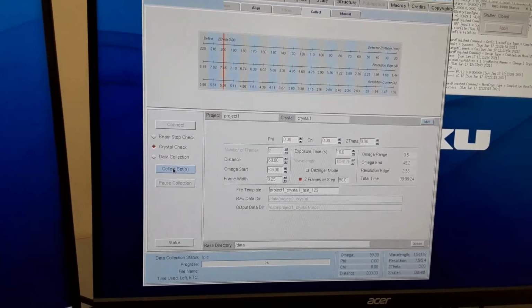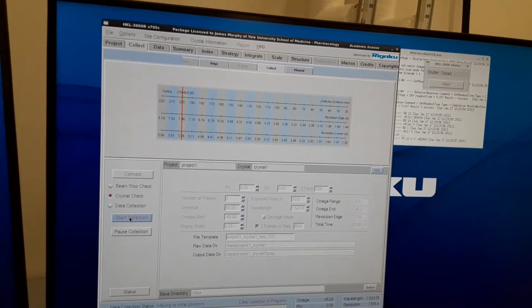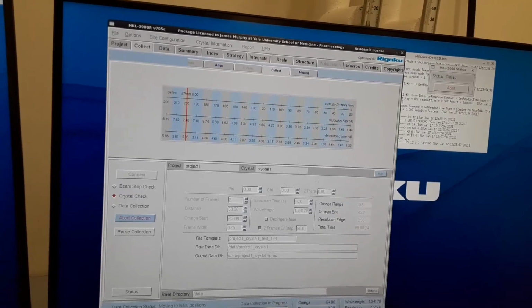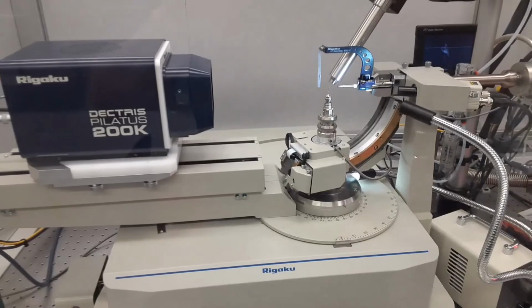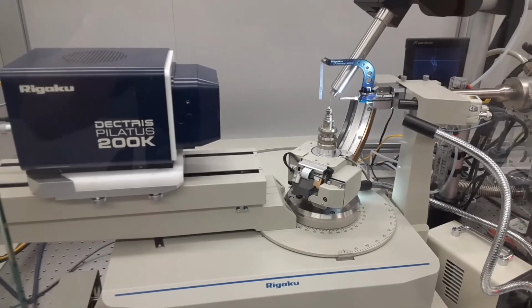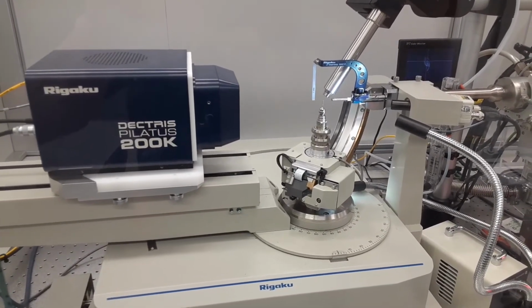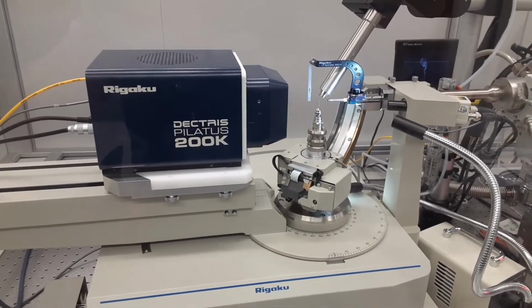So if I hit collect sets, you'll see the computer's responding up here in the terminal, and that's sending commands over to the goniometer and detector to get it set up in its proper position. Here comes the detector up to the 60 millimeter distance that I told it to.